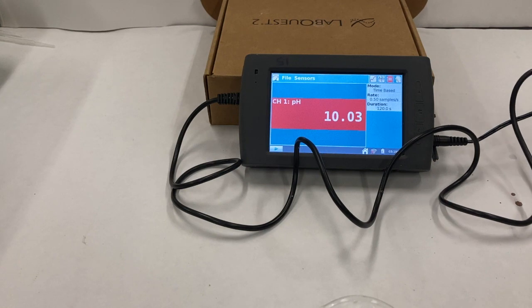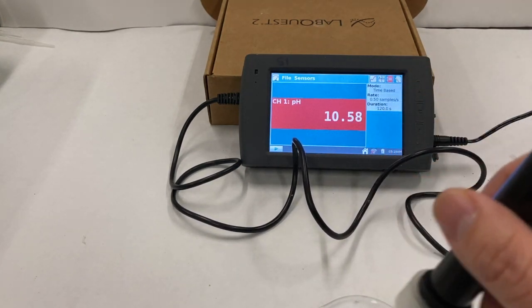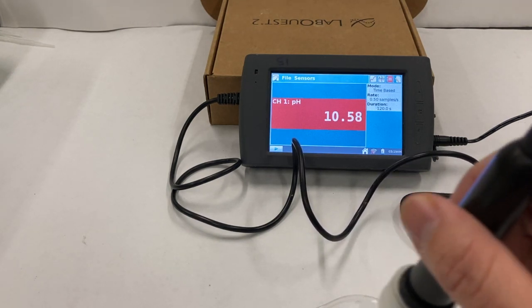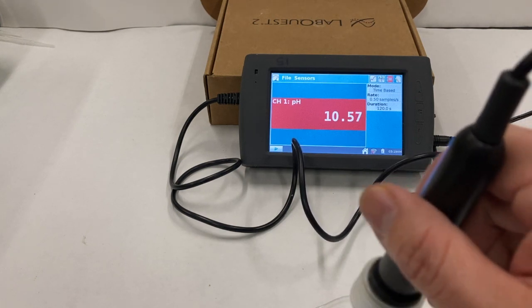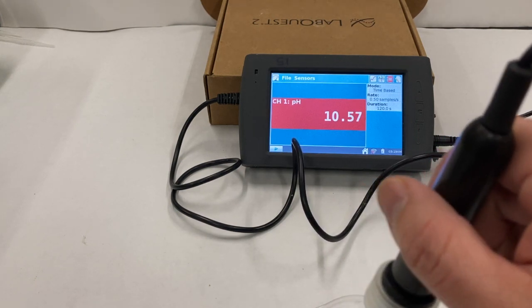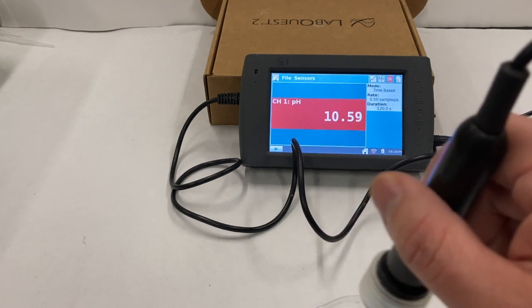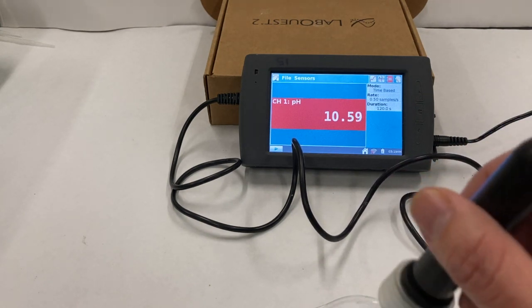All right, and our last solution is going to be ammonia, NH3. This one's not dancing around too much. We'll just call it 10.59.